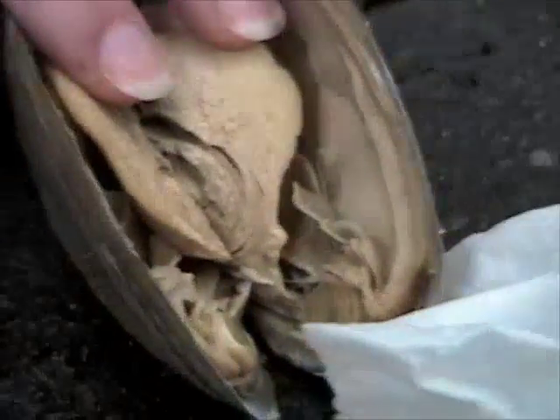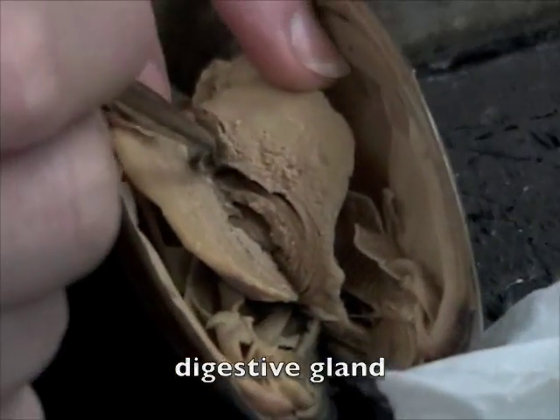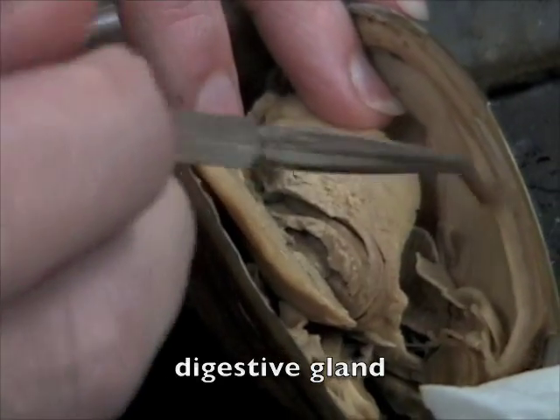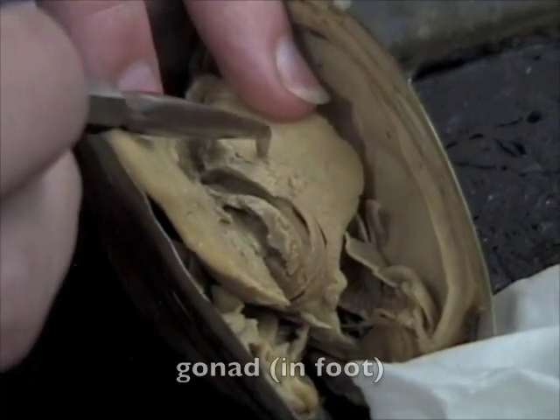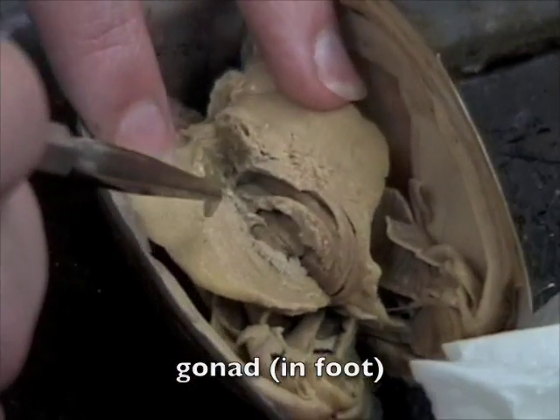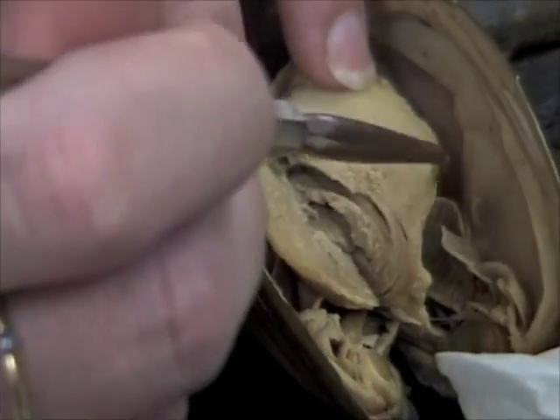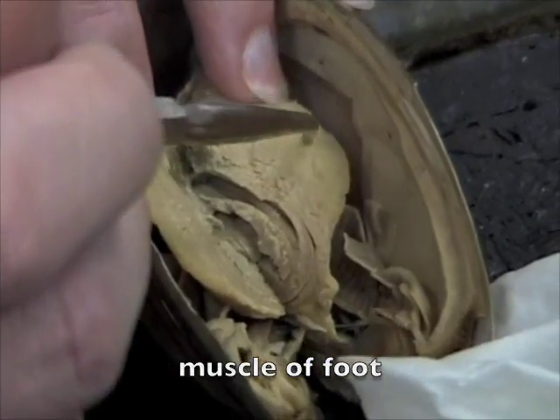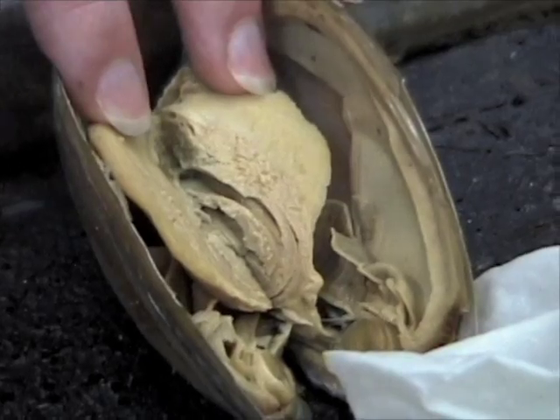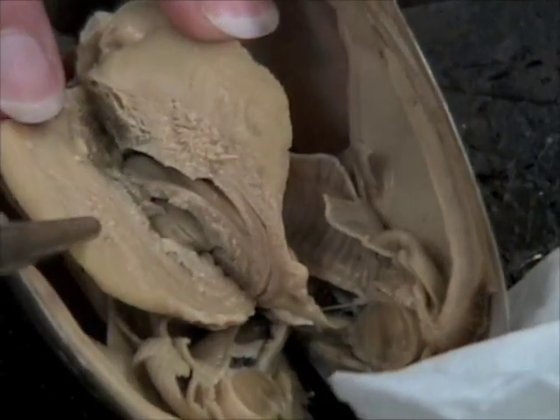We don't need to know ventricle and auricle because we can't see it. What we do need to know is this dark stuff is the digestive gland. And this spongy material right here is gonad. This material here is all the muscular foot — so this is muscle tissue, muscle as in Popeye. So: digestive gland, gonad, muscle material of the foot.